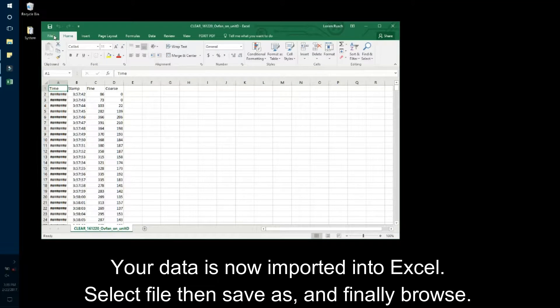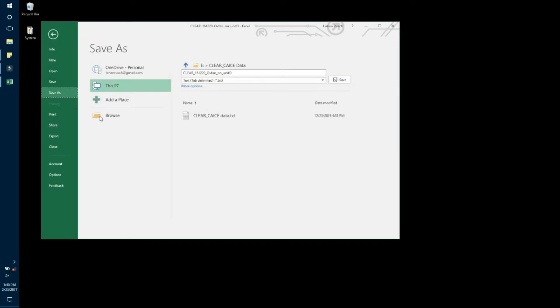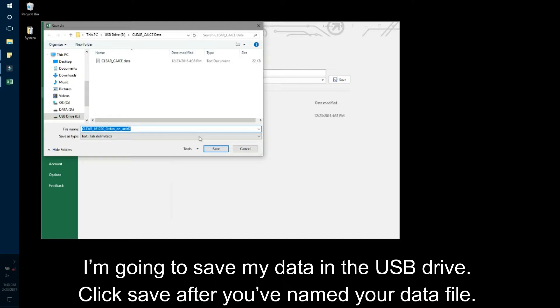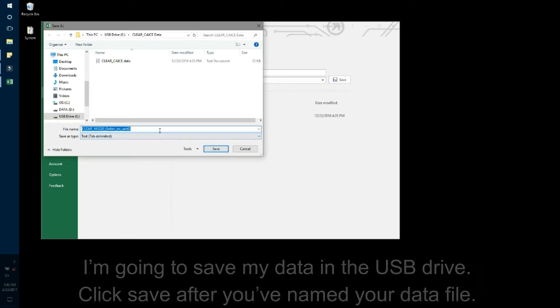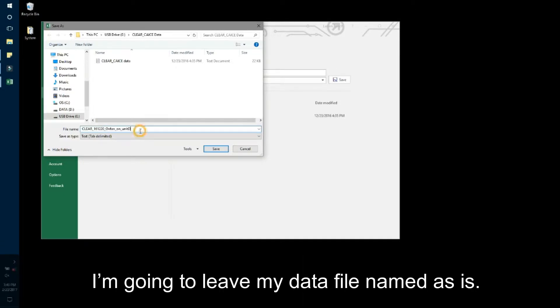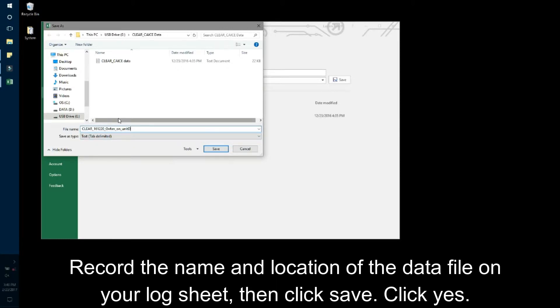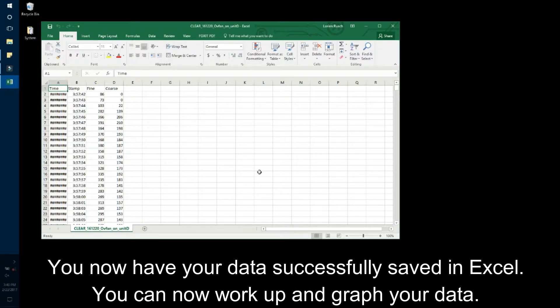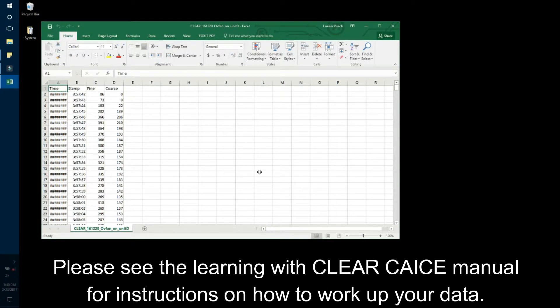Select File, then Save As, and finally Browse. I'm going to save my data in the USB drive. Click Save after you've named your data file. You'll want to name your data file so that you will remember which experiment the data file corresponds to. Record the name and location of the data file on your log sheet, then click Save. Click Yes. You now have your data successfully saved in Excel and can work up and graph your data. Please see the Learning with CLEAR CAICE manual for instructions on how to work up your data.